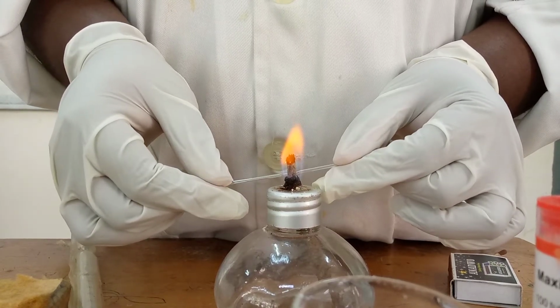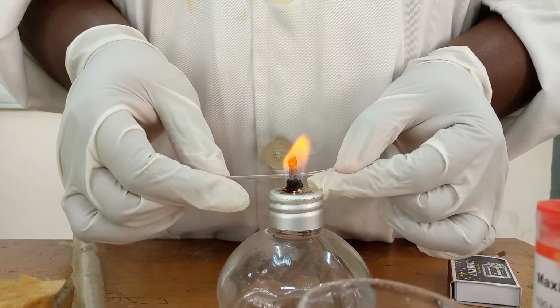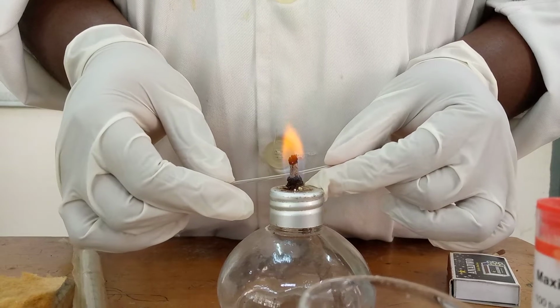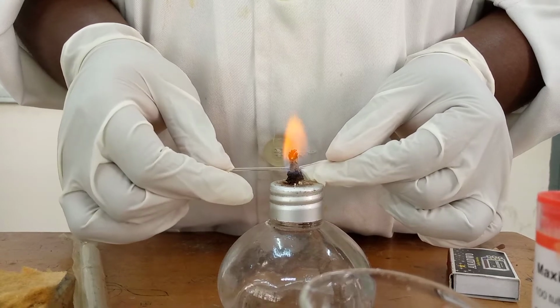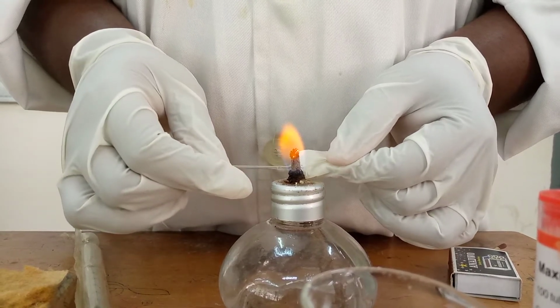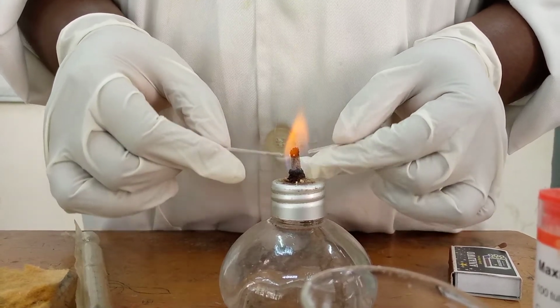It is melting. You have to be extra careful so that you don't get yourself burnt. Okay, so it's melting gradually. So I've separated it.